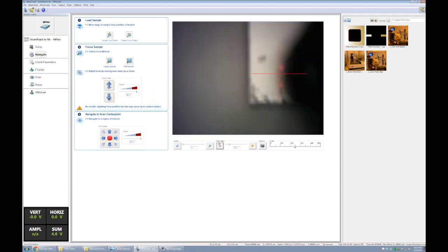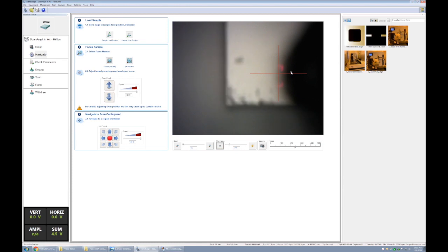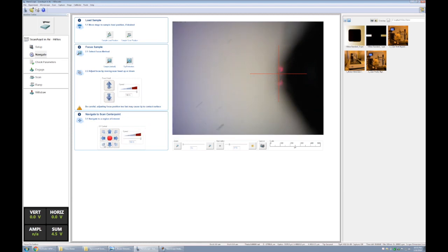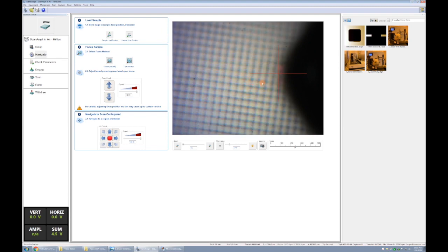We don't have to keep looking over at the actual sample. I'll turn down the illumination, double click to move it, and then we'll finalize the focus. Once we have our chip in focus, I'm going to drive to the middle of the chip where we have the actual sample that we're interested in scanning.